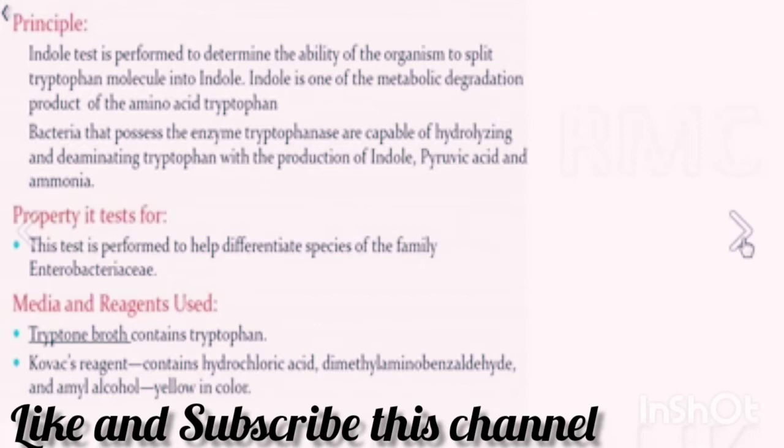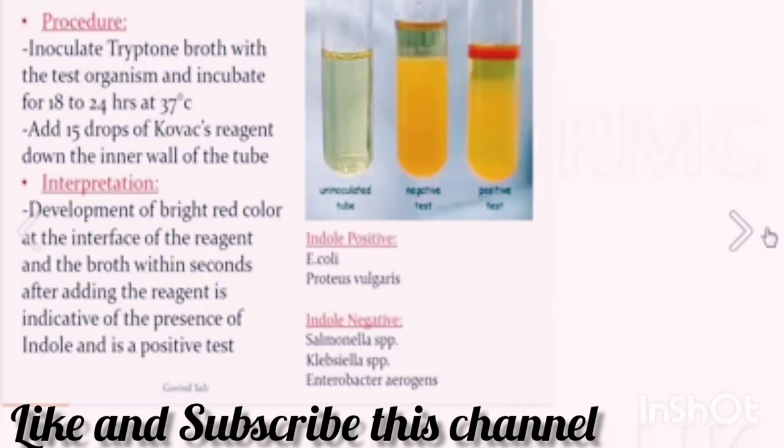Why do we perform indole test? We perform indole test because it helps us to differentiate species of the family Enterobacteriaceae. The procedure is written over here, but it is not important from the exam point of view in UHS. But indole positive and indole negative are important.